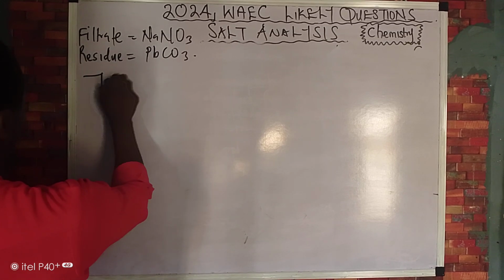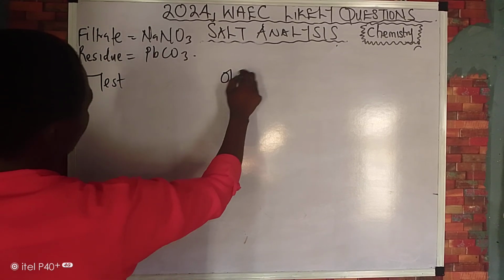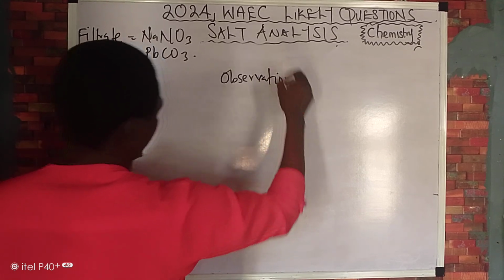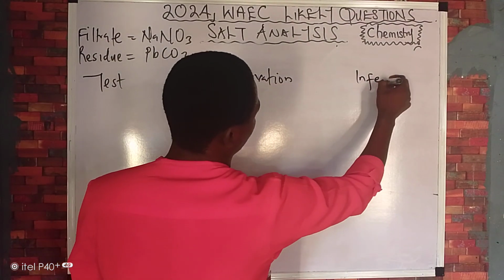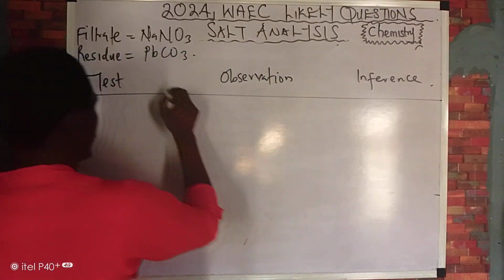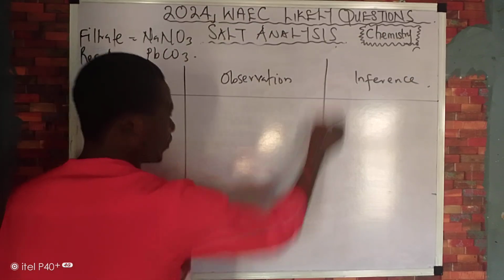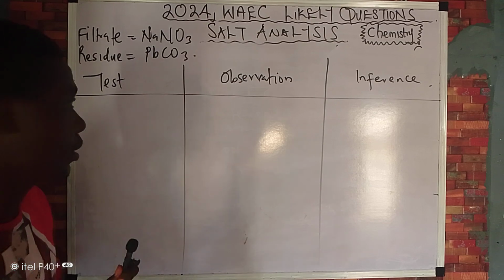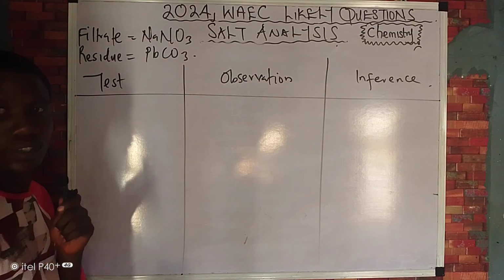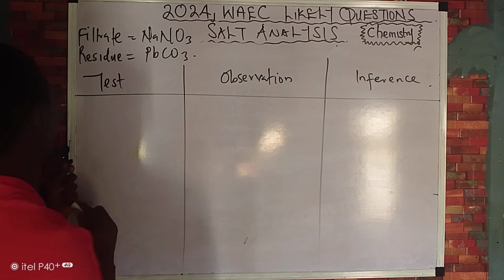So you have test, you have observation, and you have inference.